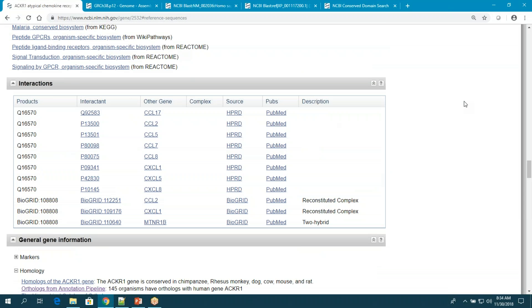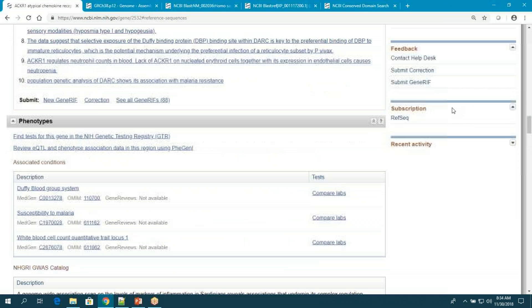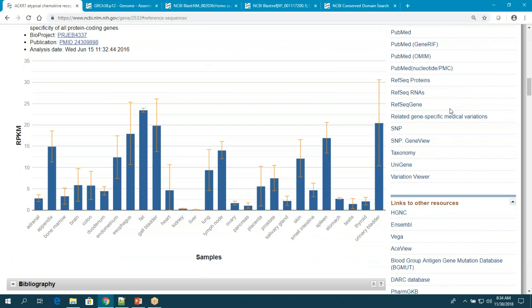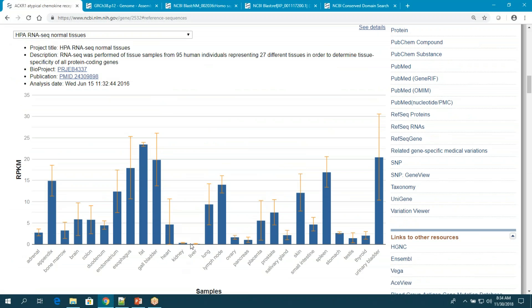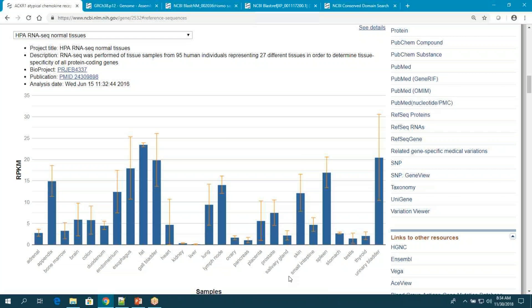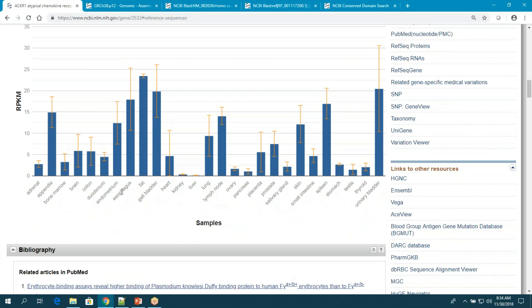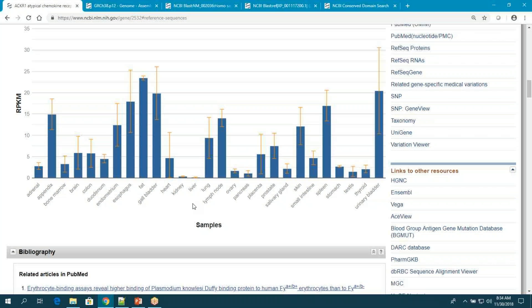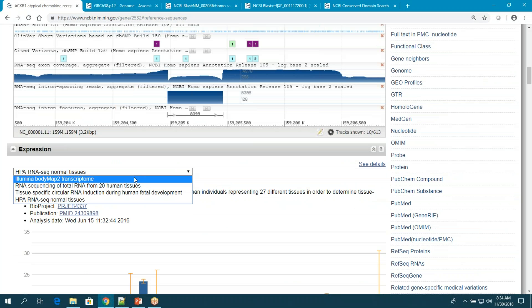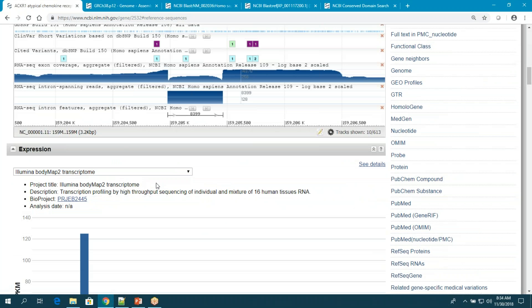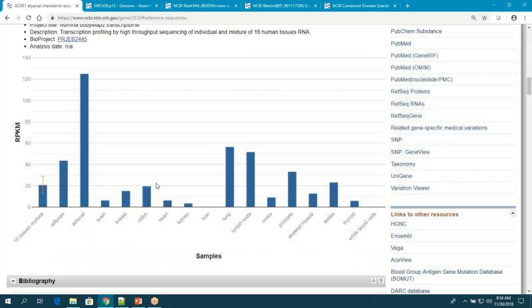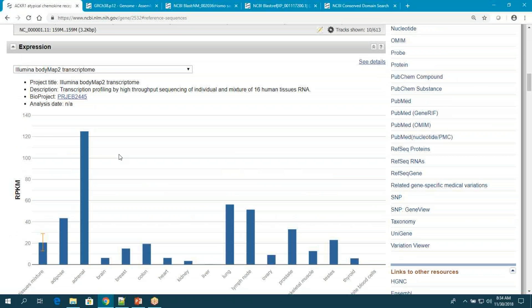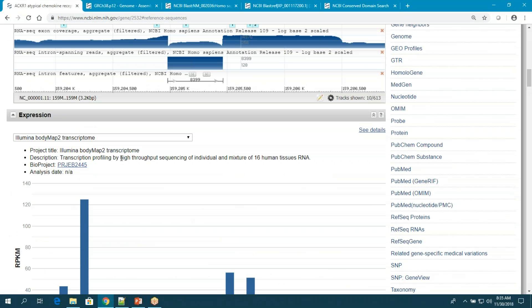We mentioned this gene is expressed in red blood cells and reticulocytes. Notice the histogram here — these are counts from RNA-seq data showing expression across different tissues. This gene has a broad expression pattern, though there are no red blood cells or reticulocyte precursors identified in this particular view. You can change which libraries are represented — this is the Human Protein Atlas; there are other options. The units are reads per kilobase per million reads — a normalized count.